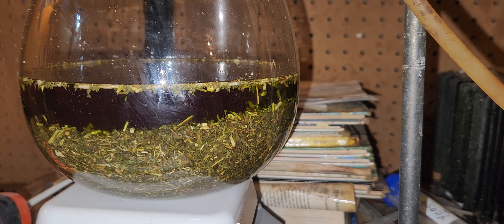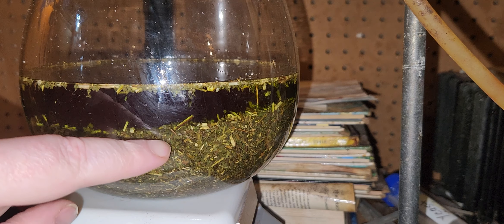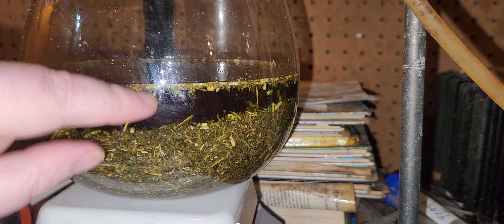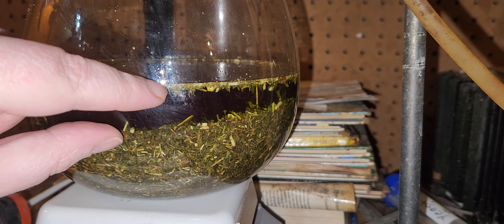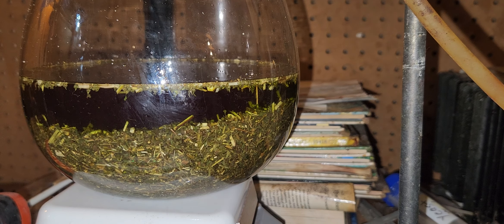Hello, this is the second part of the extraction. As you can see, this is the wormwood and this is the layer where the chlorophyll of the wormwood has been extracted with some of the oil residue.